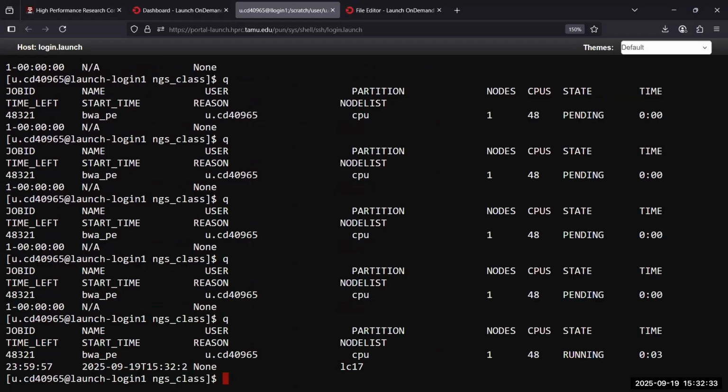What do you need to do? You need to start a new session. So close that window. Yeah. And go back to actually our cluster launch shell access to it. And I need this, remember, CD. I've got CD base.